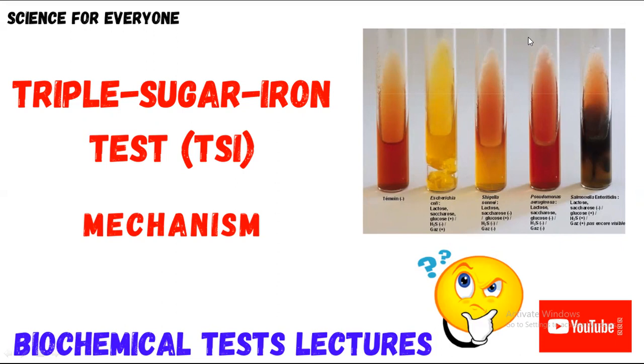The microorganisms that are examined through this test are basically related to the Enterobacteriaceae family, that include E. coli, Shigella, Pseudomonas, Salmonella, Klebsiella, and Proteus. These types of microorganisms can be differentiated from each other through this test.